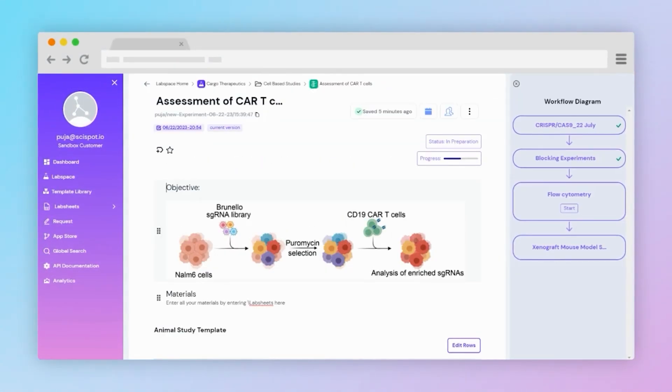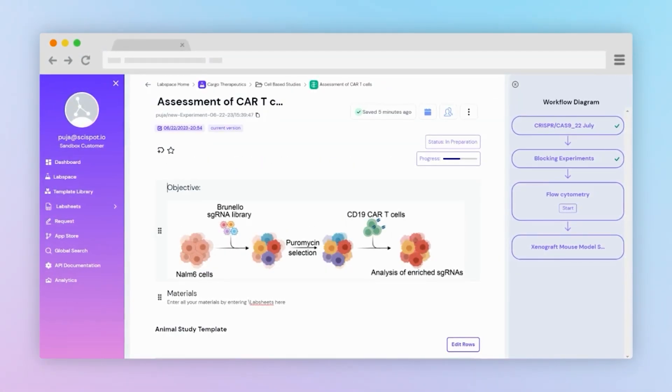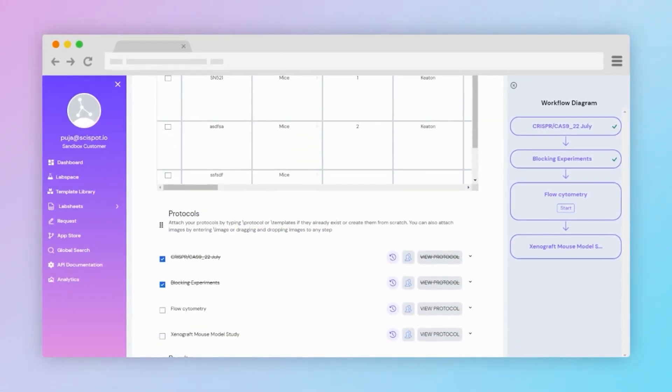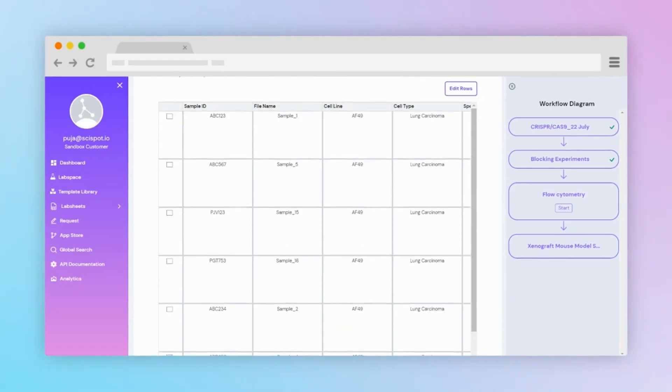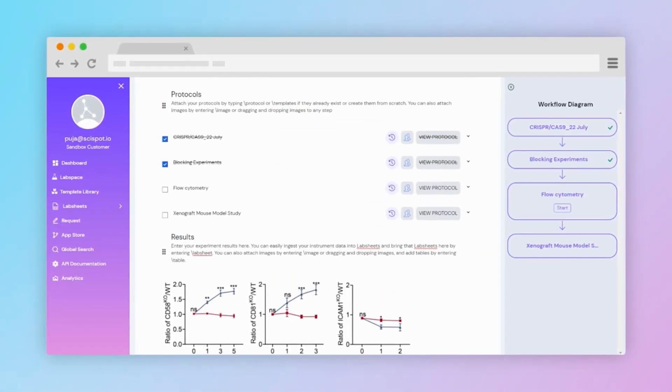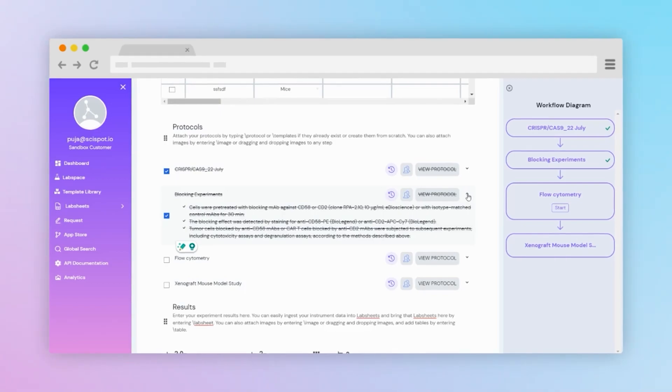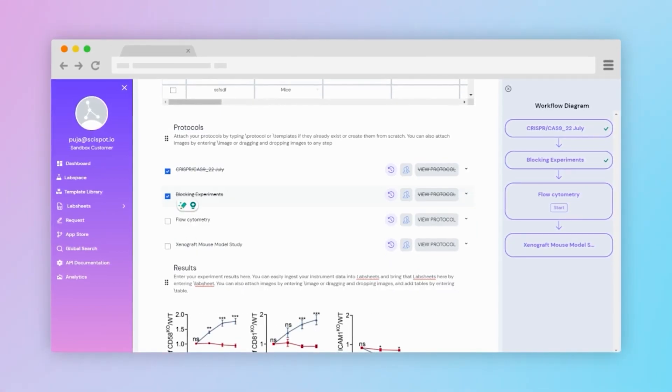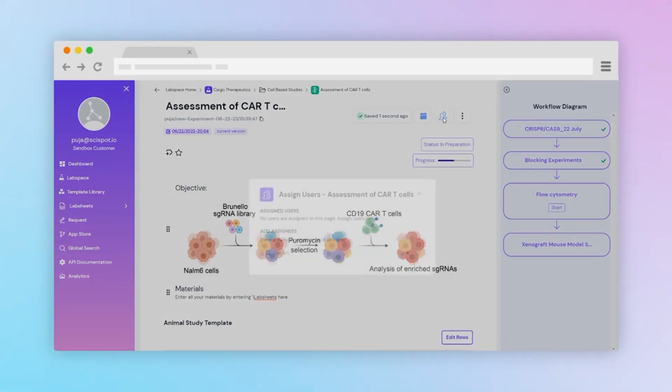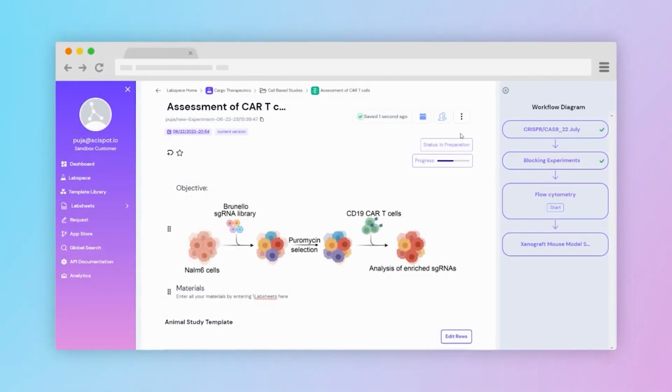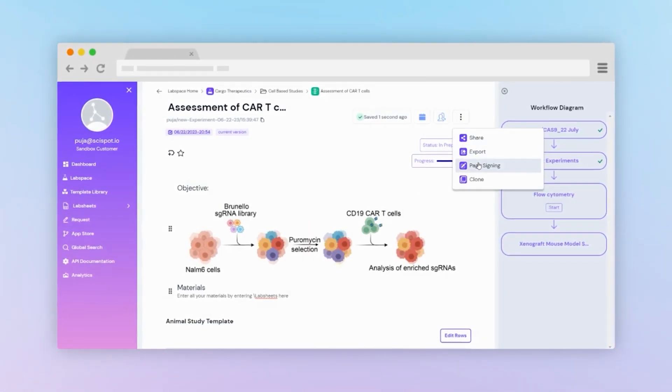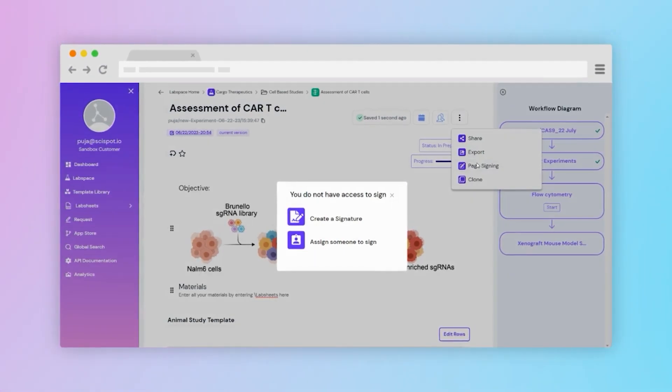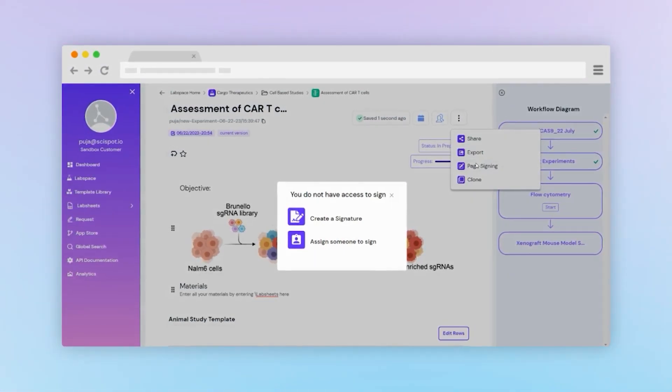Experiment pages enable the integration of lab sheets, the embedding of objectives, protocols, and the ability to track progress steps. Results can be visualized using uploaded images or lab sheets, and a workflow diagram is available for easy tracking. You can assign your team members to collaborate with them in real time and trigger reviewer approval workflows, allowing for electronic signatures and the supervisor's authority to lock or unlock a page.